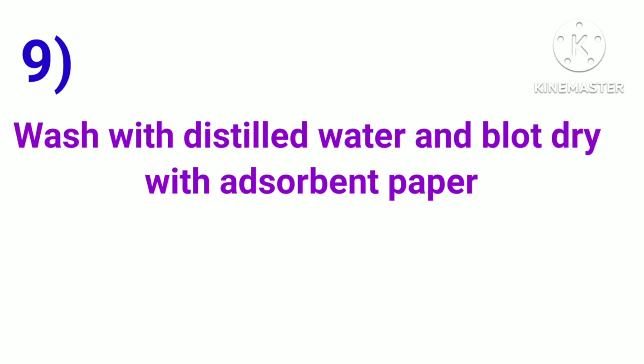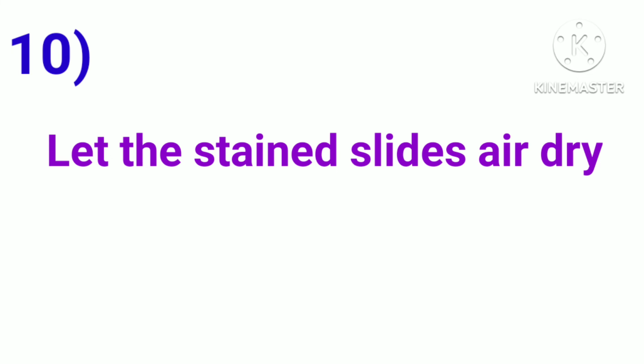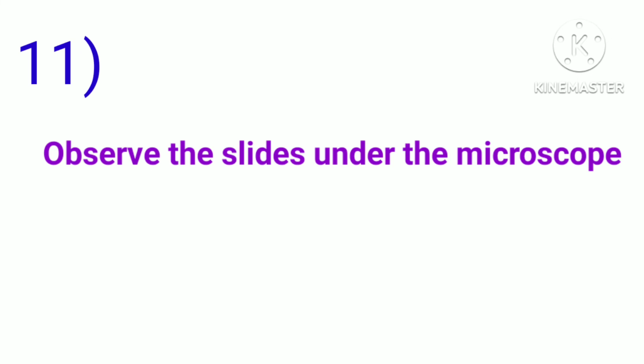In the ninth step, wash the slides with distilled water and blot dry with absorbent paper. In the 10th step, let the stained slides air dry. The 11th step is to observe the slides under the microscope.